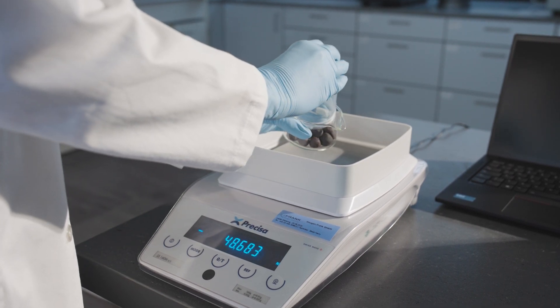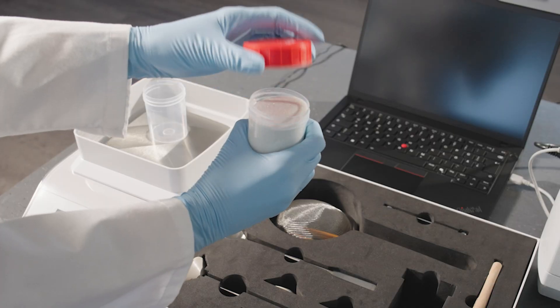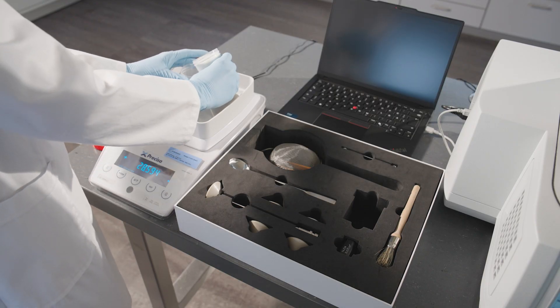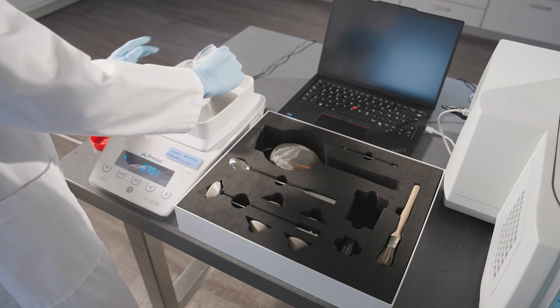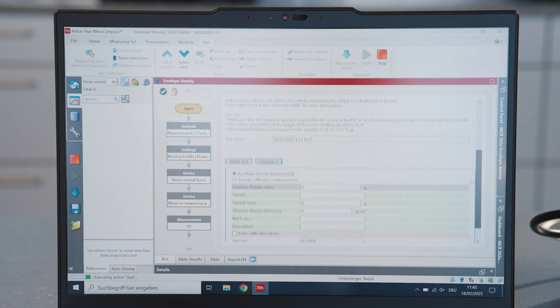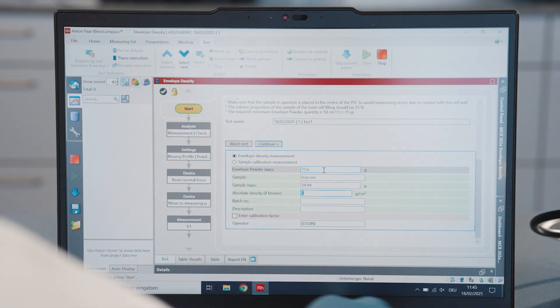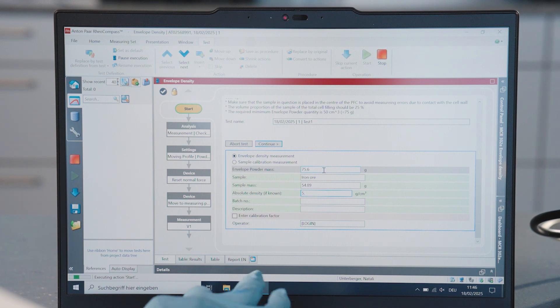Weigh sample and corresponding envelope powder mass. Enter sample and powder mass. Enter the absolute density value if the porosity is to be calculated.